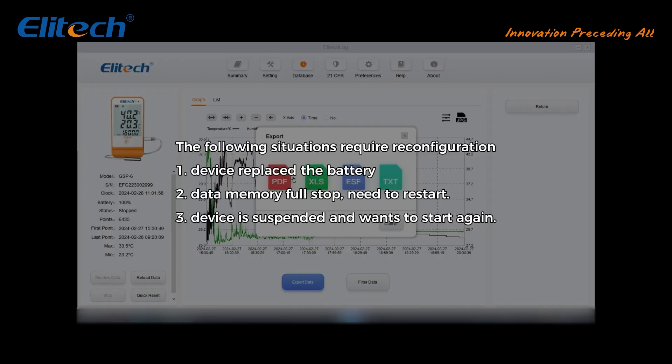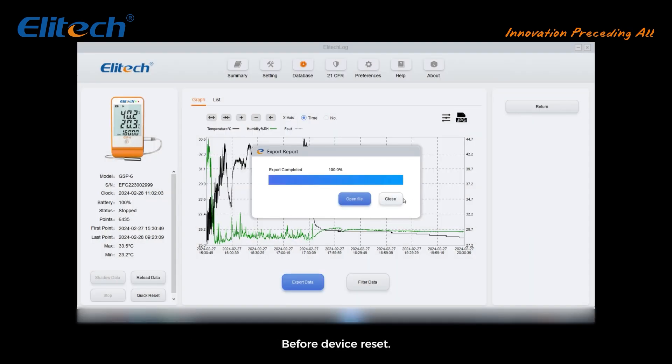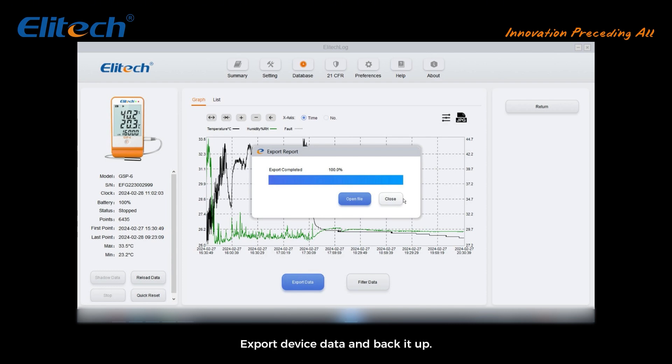The following situations require reconfiguration: 1. Device replaced the battery. 2. Data memory is full and stopped — need to restart. 3. Device is suspended and you want to start again. All these require a reset before starting recording. Before resetting the device, be sure to plug it into the computer, export device data and back it up — otherwise the data will be erased.